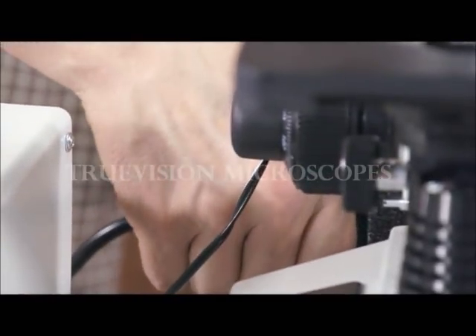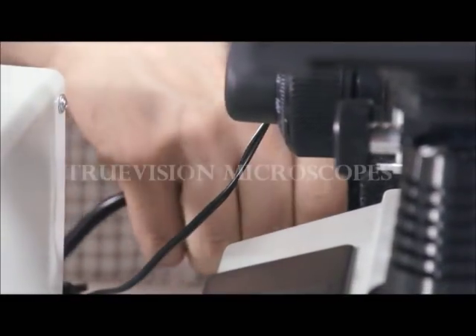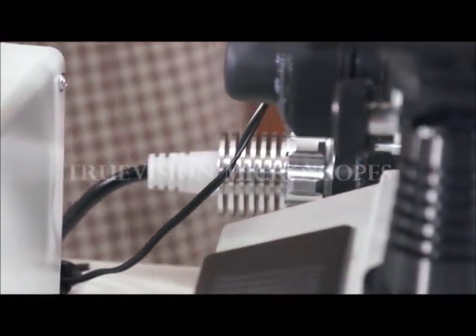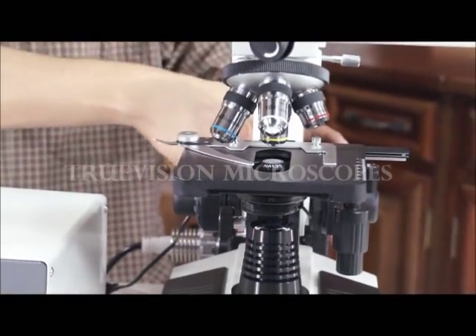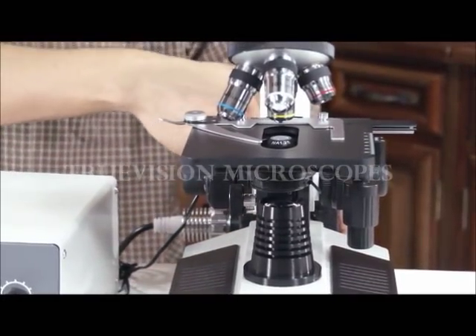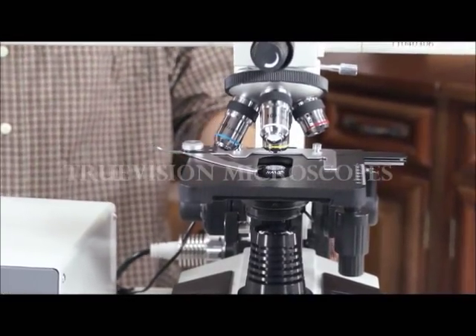You can tighten it down more. If you tighten it down enough, it doesn't tend to move at all, which is what you want after you've properly positioned the bulb. There's also a knob at the base — you can't see it from the video, but there's a knob sticking out that also adjusts and focuses the light. Adjust that knob as needed while you're looking into the eyepieces to get the best image.